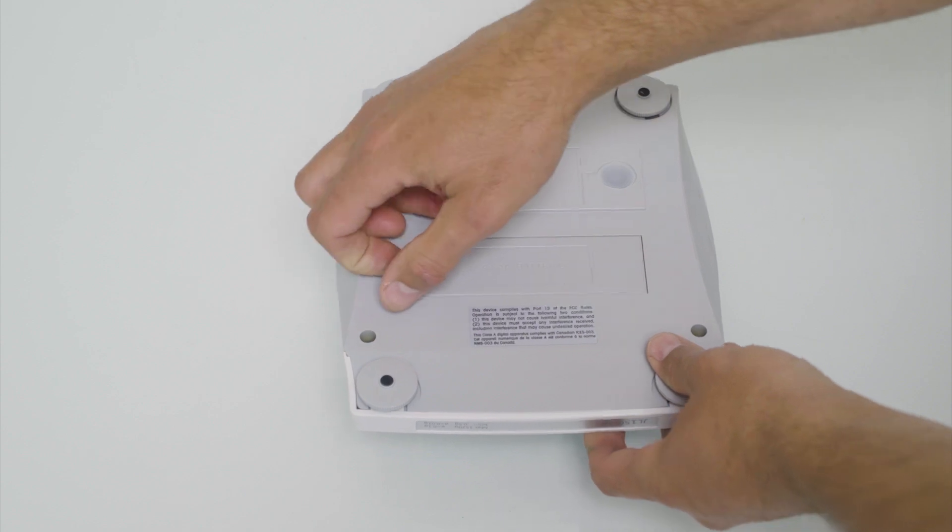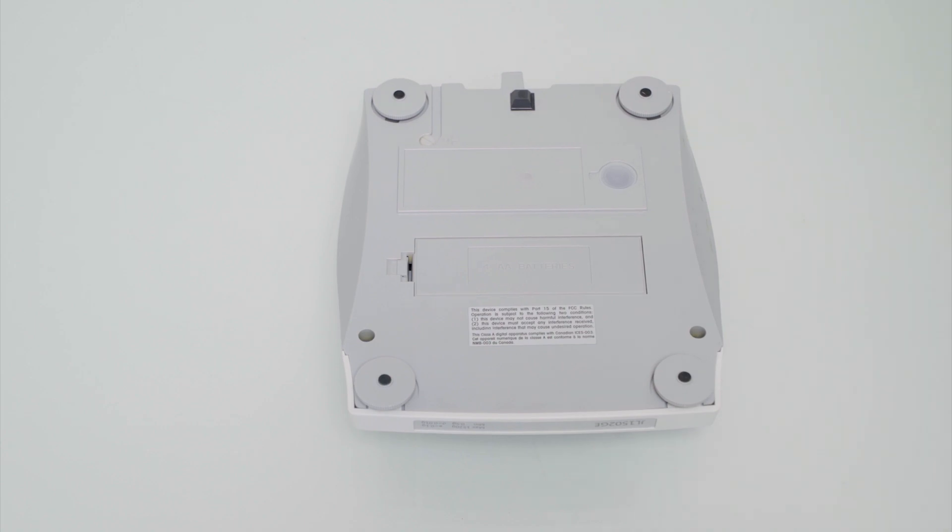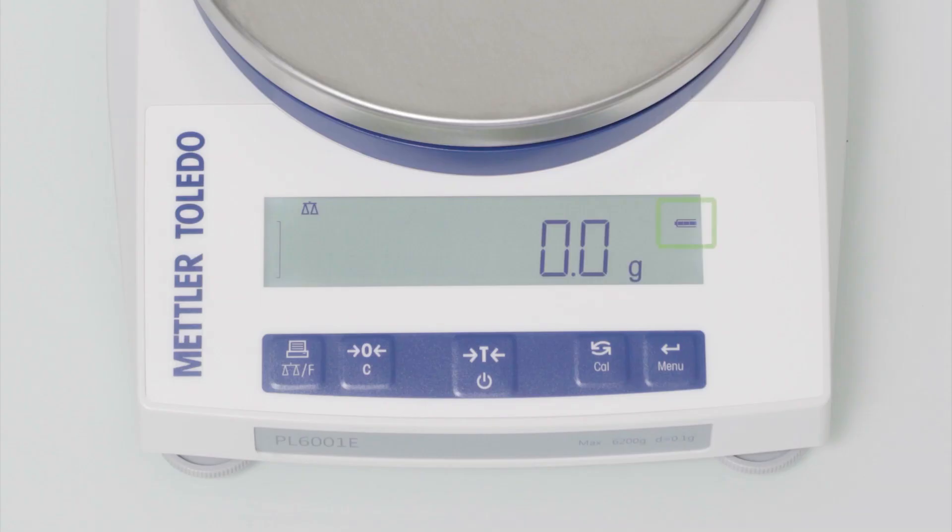When you need to weigh on the go or when a reliable power supply is not available, these balances can be operated using batteries.